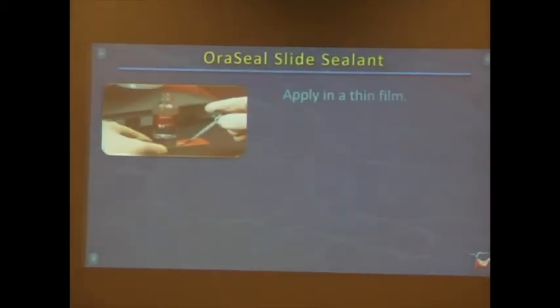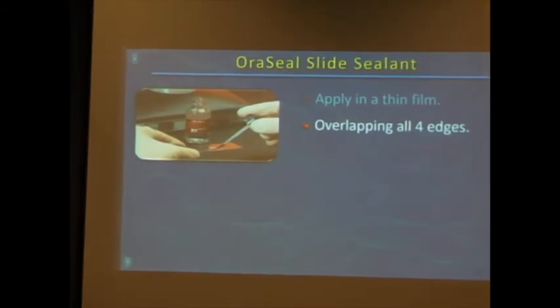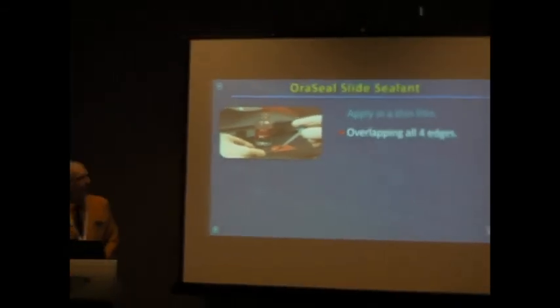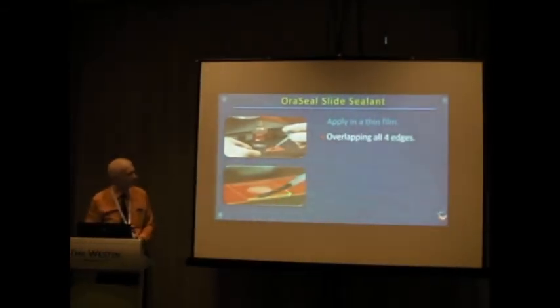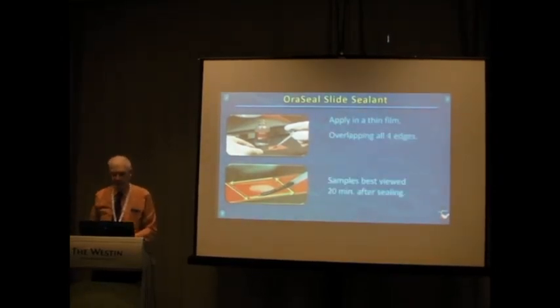Secondly, these slides will now be alive for hours and hours, if not days and days. Once you seal them and prevent air from getting into the sample and desiccating them, they can stay alive for a long time. So you apply the OraSeal by overlapping all four edges of the cover glass so that you have a continuous film all around the periphery.